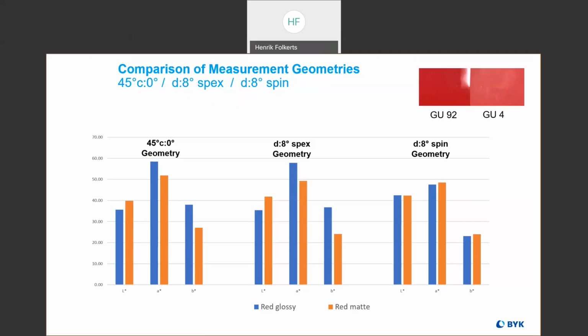Yeah, I can't imagine it would have any difficulty with that. Just keep in mind that if you're dealing with differences in gloss level, that will be reflected with the 45-0 instrument. Does that help, or did that answer your question? Yes, a bit. It's a new subject for me. No, that's okay. We can have someone reach out to you too, and make sure all your questions are answered thoroughly with either a WebEx or phone conversation, or even on site also.